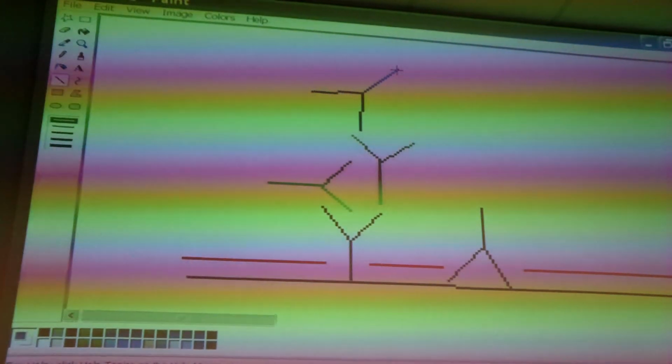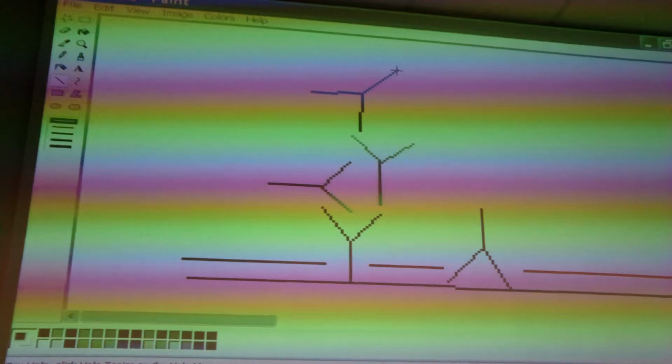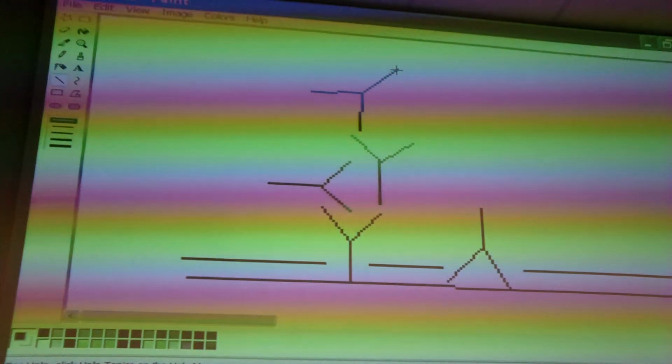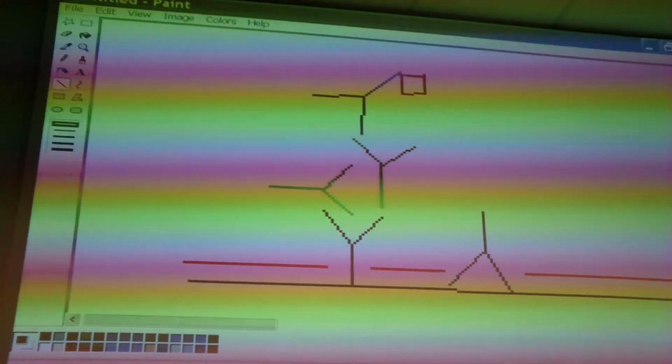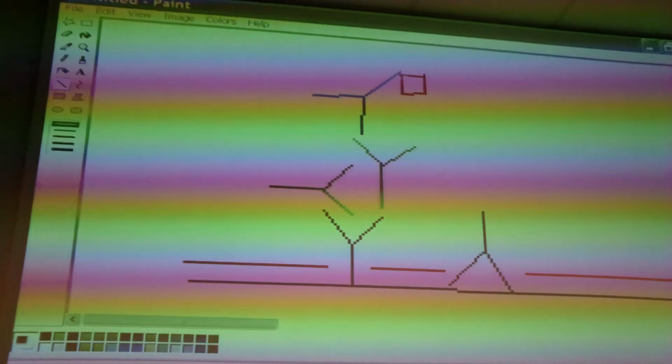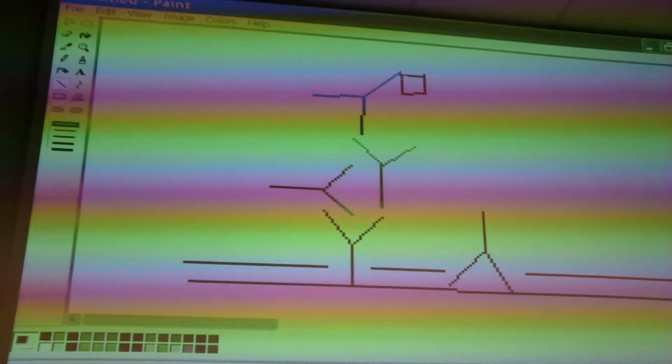It's also in the protocol. I think on the last page there's a list with other typically used enzymes. I'm going to represent the peroxidase simply like this. So let's imagine you can buy these antibodies already directly coupled. Sometimes they're biotinylated. Have you heard about biotinylation? Yeah. Okay.